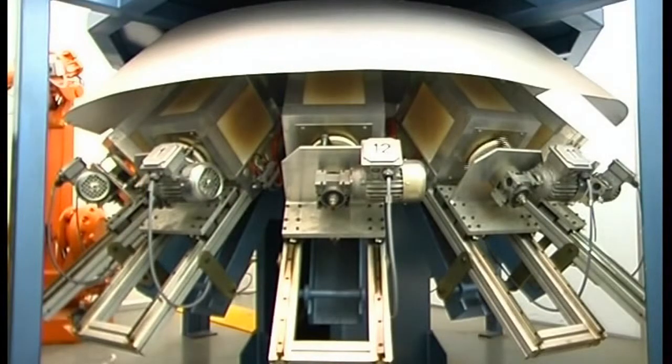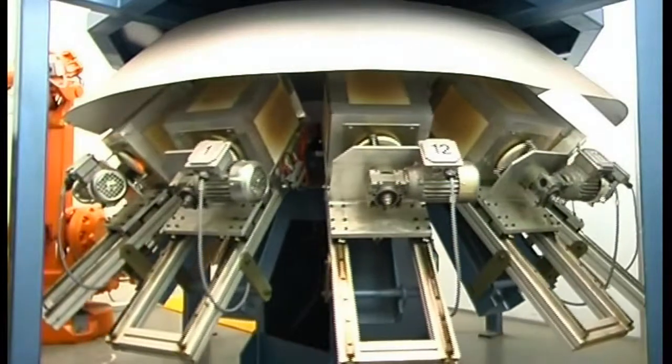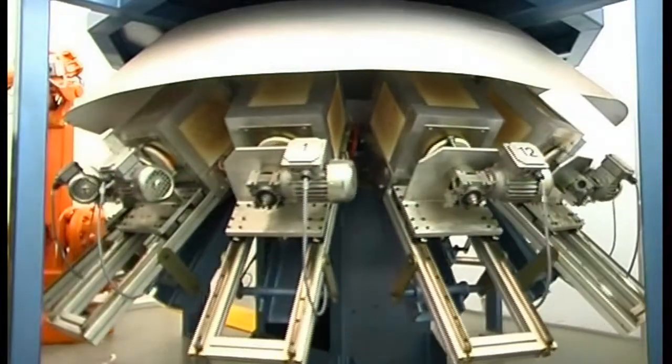The robotic system has 12 electrically heated tube furnaces inclined at 45 degrees that rotate on a furnace carousel.